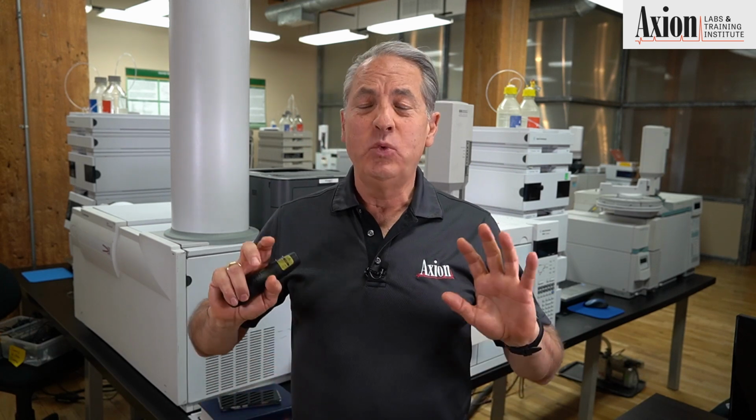Most people think this is really complicated because they think, oh my gosh, HPLC has so many variables. We've got column length and particle size and flow rate and temperature, and how do I make sense out of all of it? But it turns out that there's only 3 things that can affect your separation, and you are in charge of all 3. Let me show you what they are, let me prove to you that you're in charge of them, and then we're going to jump into what to do if the simple stuff does not work.